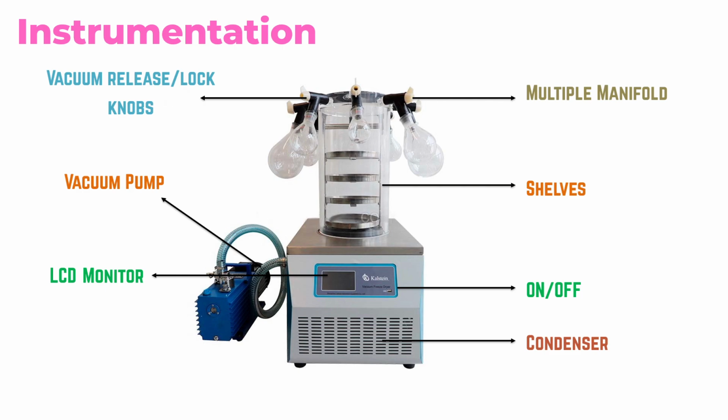When you start the vacuum pump, there is a warm-up mode, and you need to wait about 20 minutes after starting the warm-up. These steps should be followed when putting the sample inside the chamber. Freeze the sample in the deep freezer or liquid nitrogen. As we discussed earlier, we need to deep freeze the sample, and then adjust the particular required temperature and pressure.